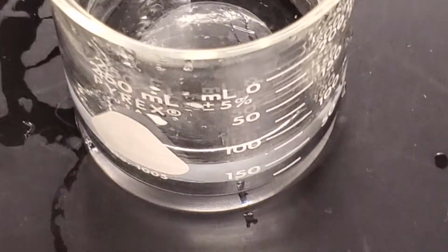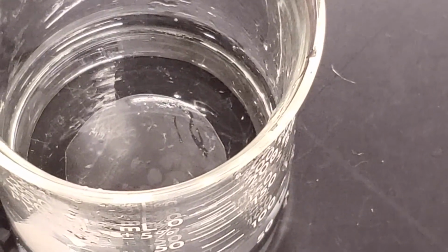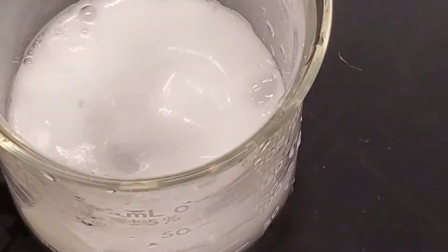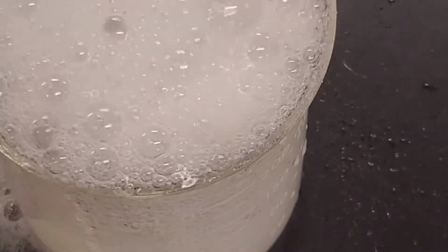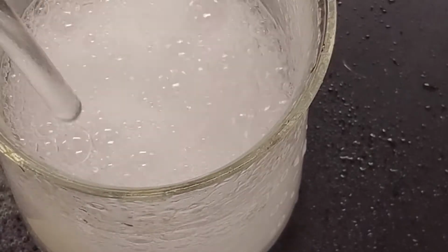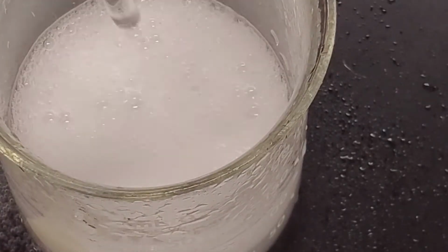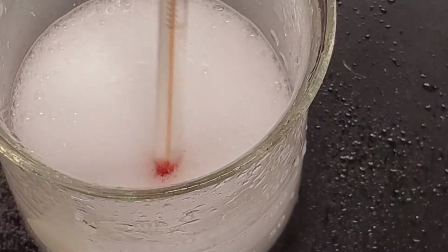Make sure you pay attention to any signs or indicators that a change has happened or that a chemical reaction has occurred. All right, so we're going to add the thermometer and wait for 2 minutes.